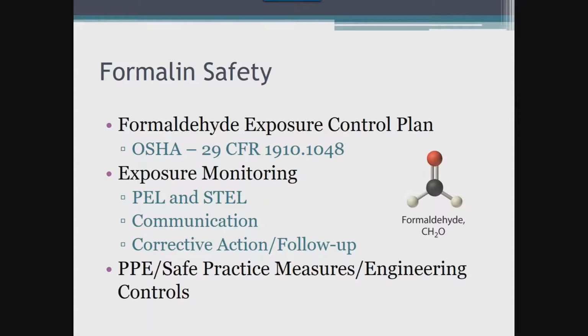Formaldehyde is the primary preservative or fixative used within the anatomic pathology laboratory. The solution is often used to fix gross tissue, autopsy specimens, and cytology cell blocks. Formaldehyde is a colorless aqueous solution that has an irritating pungent odor and is classified as an upper respiratory irritant because of its high solubility in water.